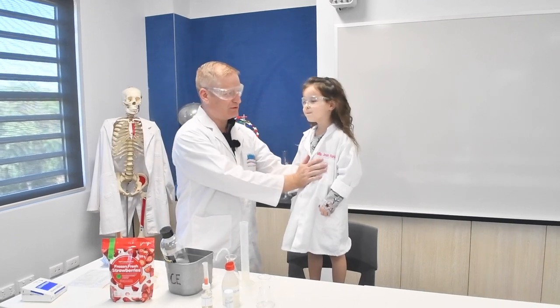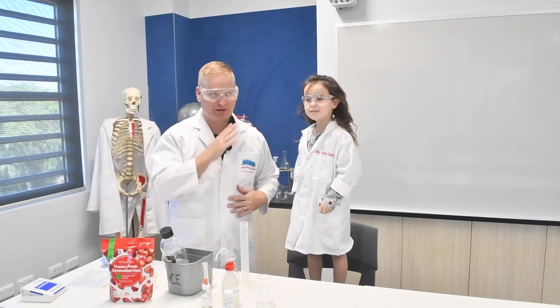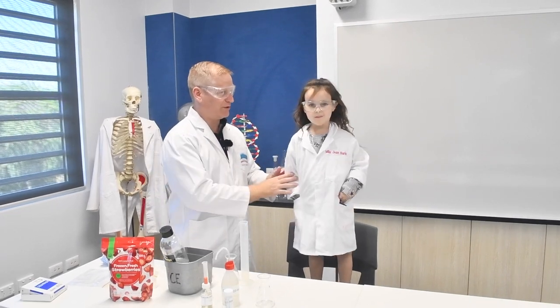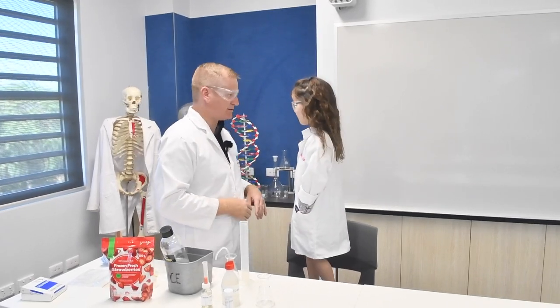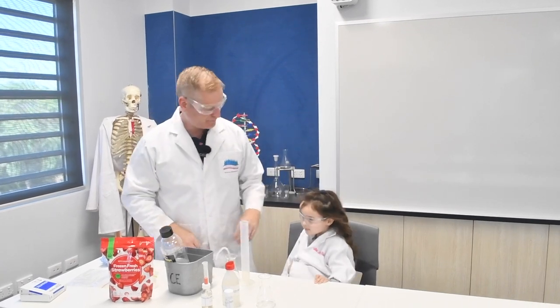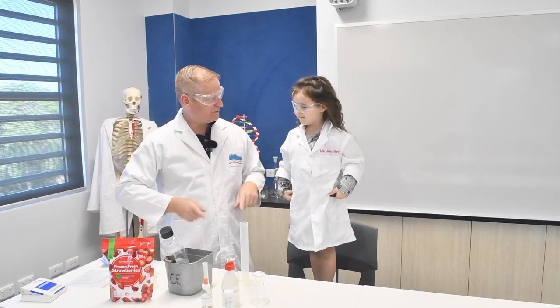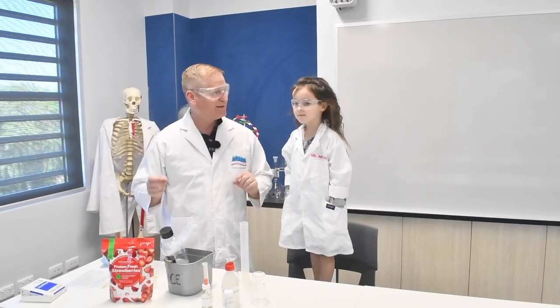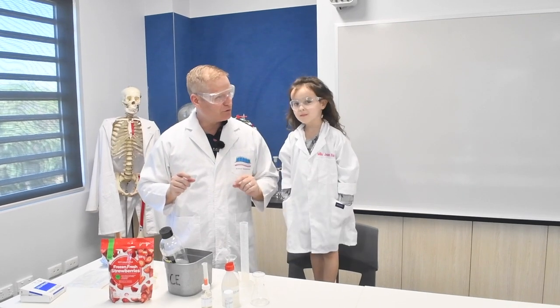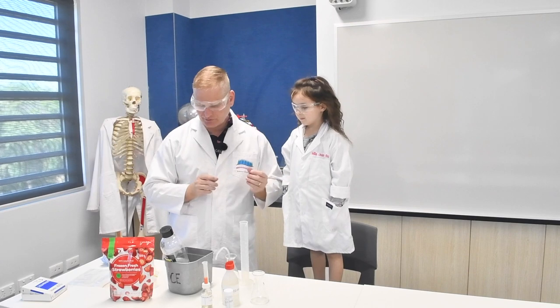It's inside you, it makes Mila Mila, and it's inside Daddy, Mr. Burek, and it makes Mr. Burek, or Daddy, what he is. It's inside trees, it's inside ants and spiders. Everything that's living is made up of DNA. So, today is about breaking down the strawberries and getting the DNA out of the strawberries so we can look at it and actually see it for real.